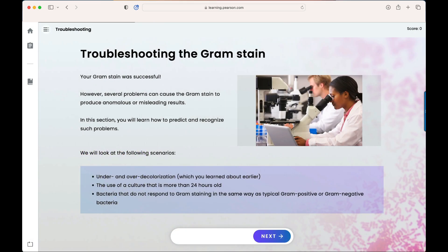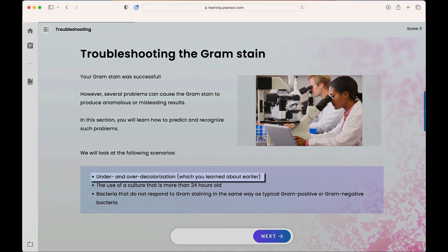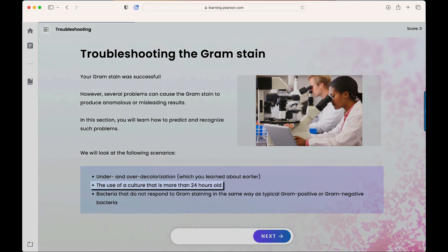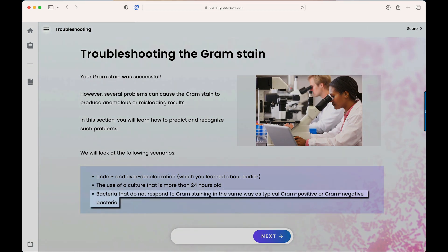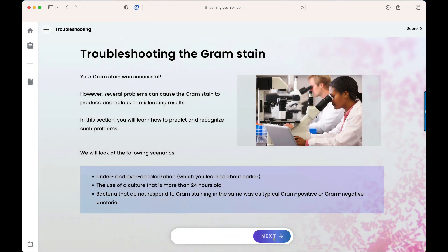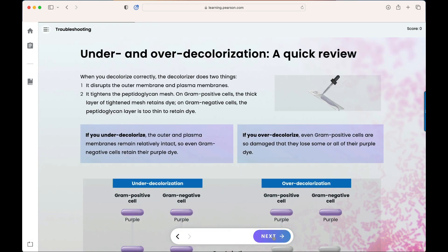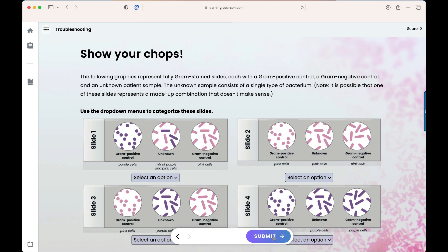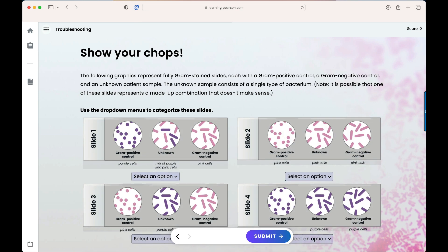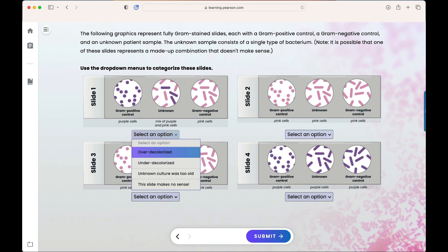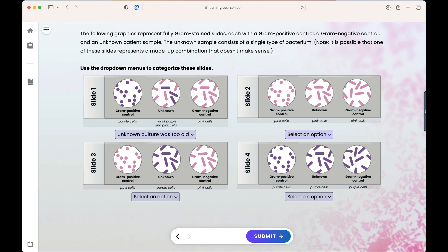In the troubleshooting section, students will learn how to handle problems that can cause the gram stain to produce anomalous or misleading results. On the initial screen, students will look at scenarios of over and under decolorizing, the use of a culture that's more than 24 hours old, and bacteria that do not respond to gram staining in a typical way. Students are asked to categorize slides based on what they see, and answer questions in varying formats to expose them to material in a way that simulates what they might see in the wet lab.